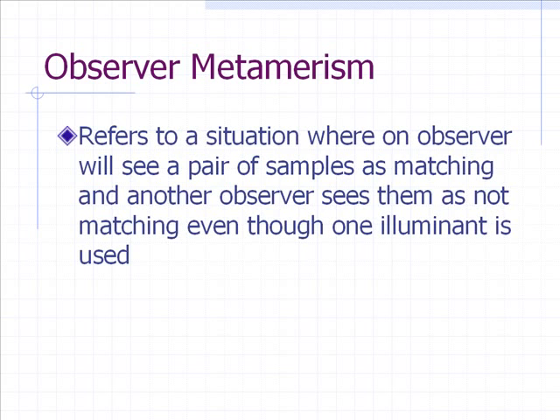Observer metamerism refers to a situation where an observer will see a pair of samples as matching and another observer sees them as not matching, even though one illuminant is used. Could be two different shifts at a plant. The day shift person is more picky than the midnight shift QC person. The very same set of samples goes to day shift. He says, no, those are no good. You hang on to it. You don't get rid of it. You give it to the night shift QC person, and they say, oh yeah, that's close enough. Sound familiar? That's due to the differences in color perception between two observers.